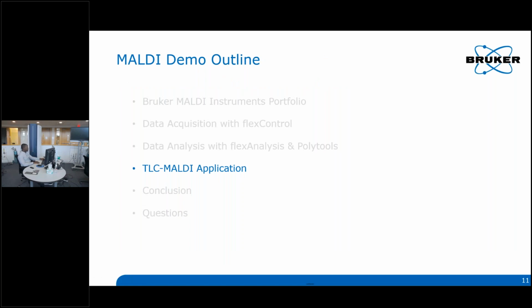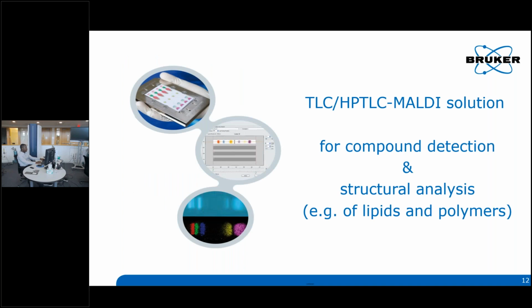So lastly, since we have a few minutes, I wanted to introduce you guys to our TLC MALDI technology that we have developed here at Bruker. And most of you are likely familiar with TLC, thin layer chromatography. This is an indispensable separation technique in most labs with a number of applications in forensics, in food analysis, in clinical and industrial applications. Just because it's a quick and simple way of determining what kind of components you have in your mixture.